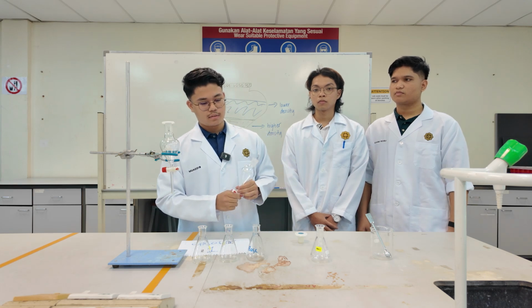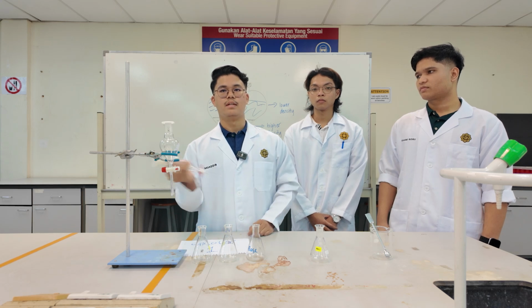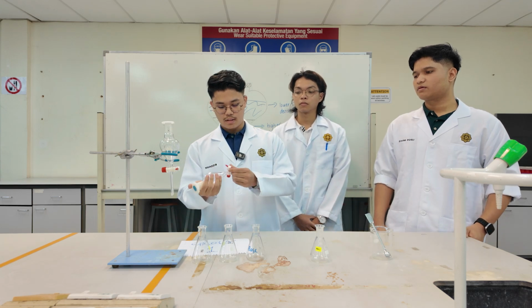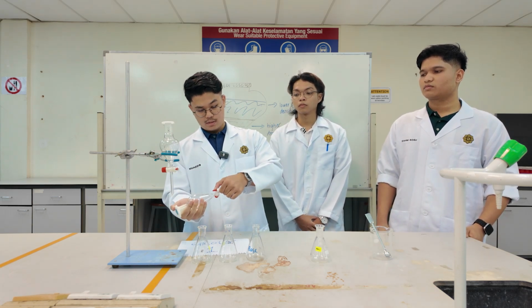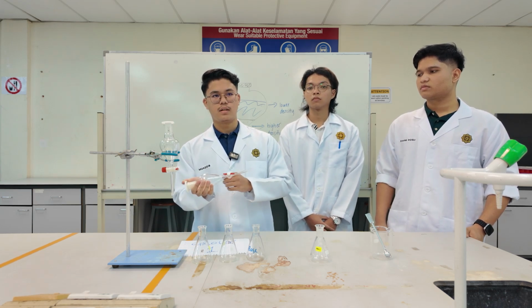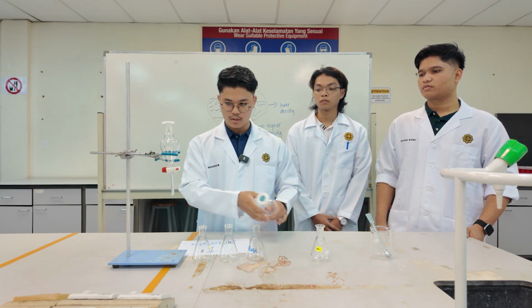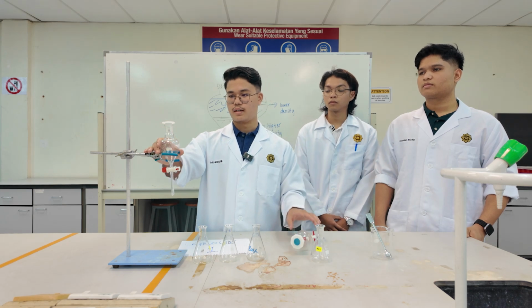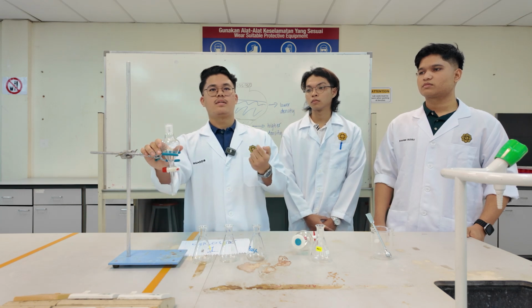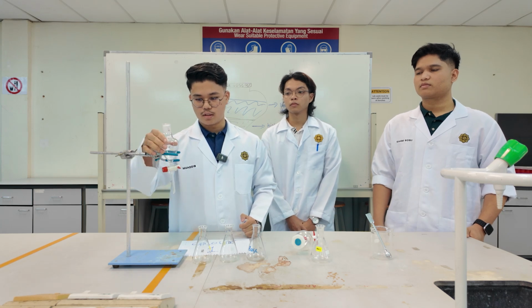And after that, we need to close the stopper and shake it vigorously so that the reaction will happen completely. After that, we need to open the stopcock to release the pressure inside the separatory funnel, because the reaction will release pressure. Then close the stopcock, and we put it on the retort stand. After that, we open the stopper to make sure atmospheric pressure pushes down all the liquid that we need to extract.